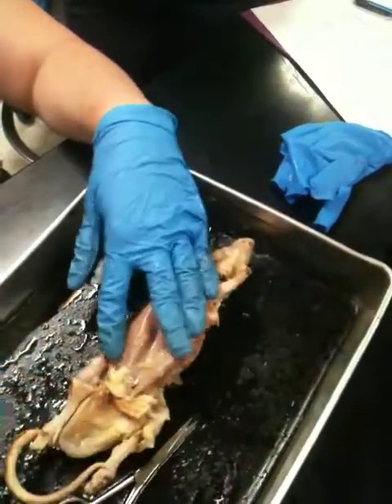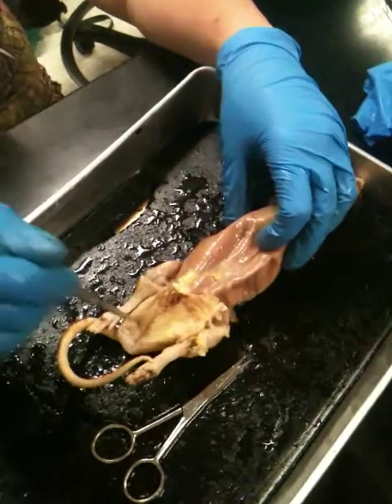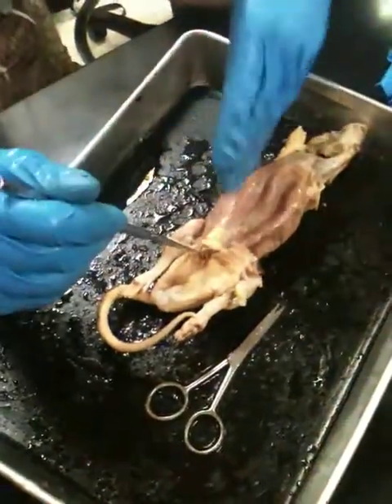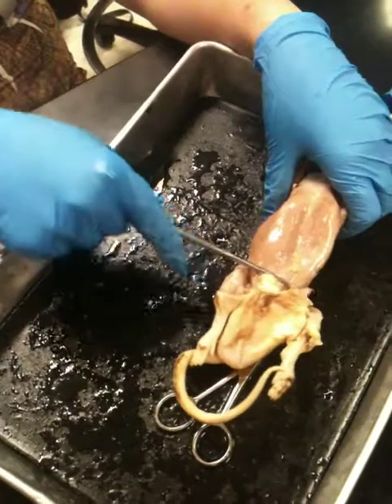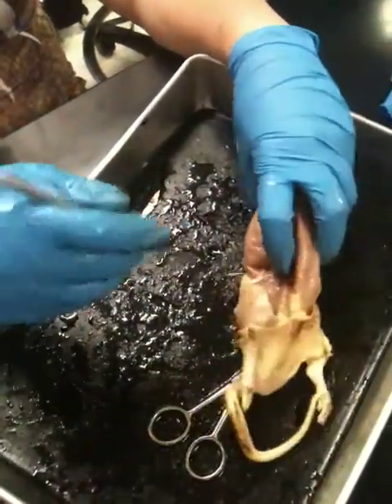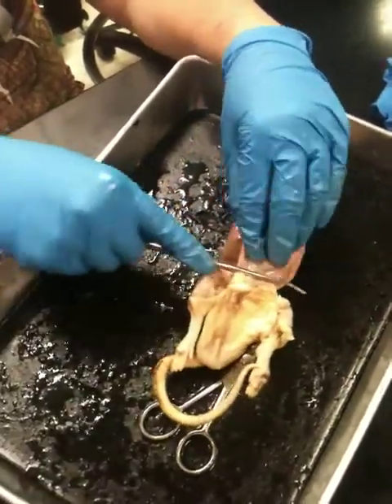Let's see what else. We've talked about umbilical. Now, this is a male, so anything near the scrotum or near where the penis would enter or exit, rather, would be the genital subdivision. Anything above it, right about here, would be the pubic. Pubic right here, pelvic is going to be right here.